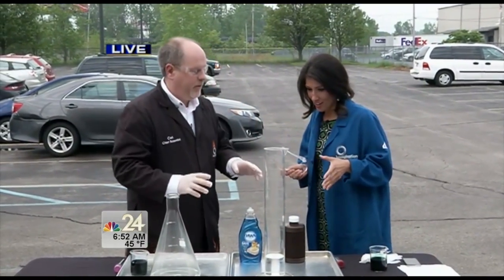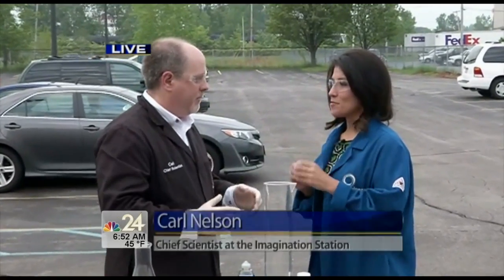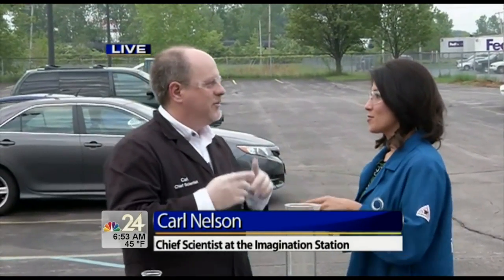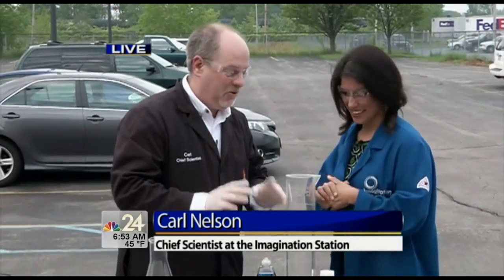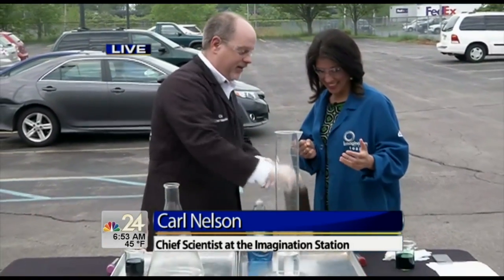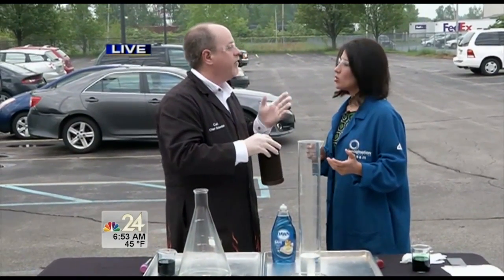This is a classic experiment that we do during our Super Splatter Science Summer Camp — say that three times fast! We can do some really cool, crazy science. What I have here is hydrogen peroxide. It's not the stuff you have at home — this is 35% concentration.